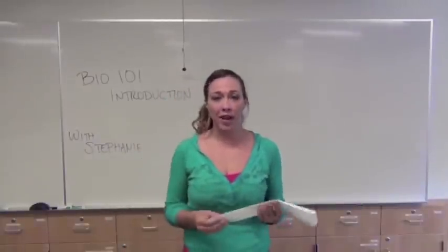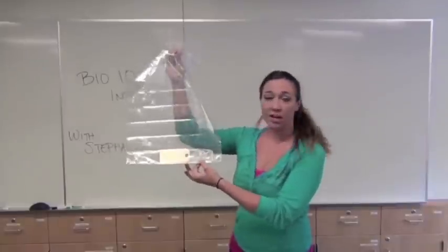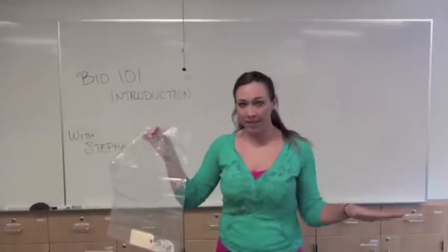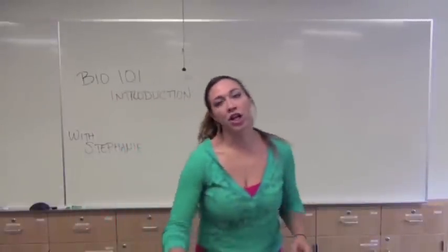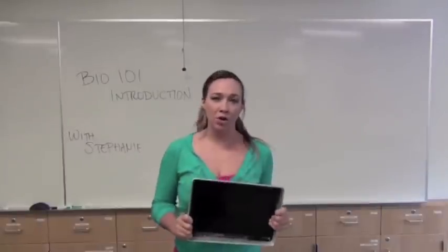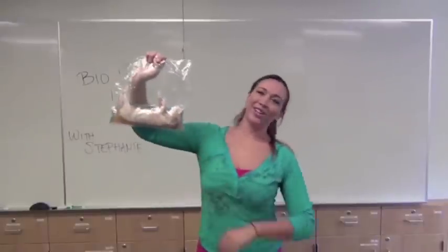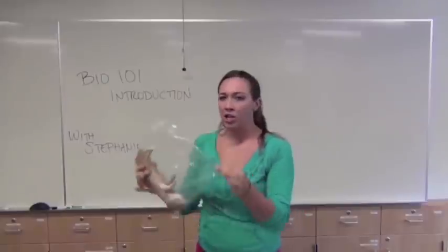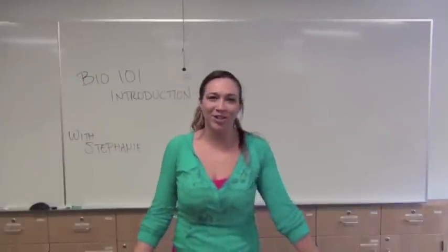Your TA will provide you a bag with a little tag and strings. Don't throw any of this away — keep the bag, the tag, and the strings for all four weeks of your pig dissection. You'll then go get a tray, and in the fume hood get your pig. The fetal pig comes sitting in liquid, so the first thing you'll do is cut a little hole in the bag and dump the liquid into our receptacles — this liquid does not go down the sink.